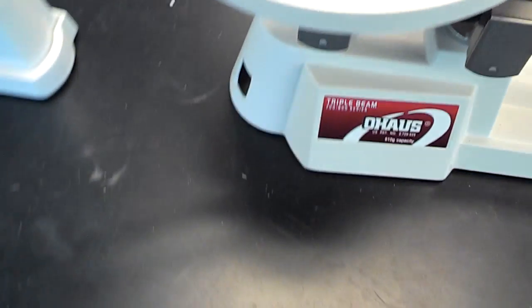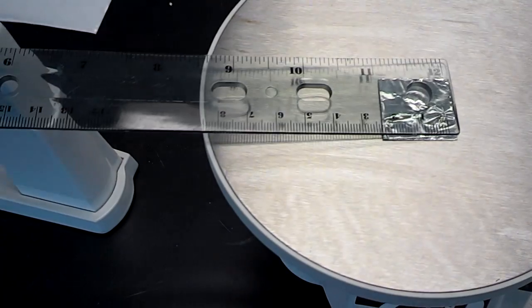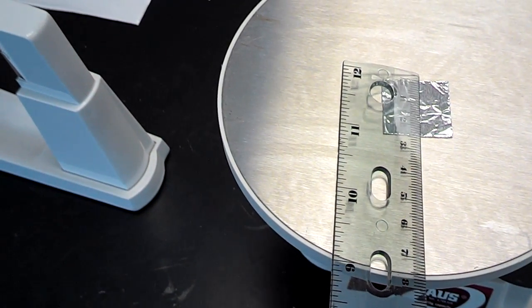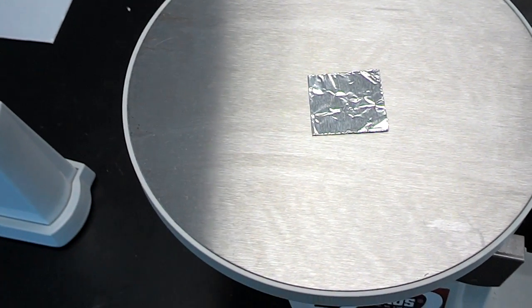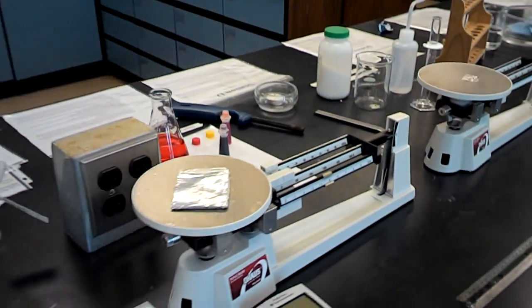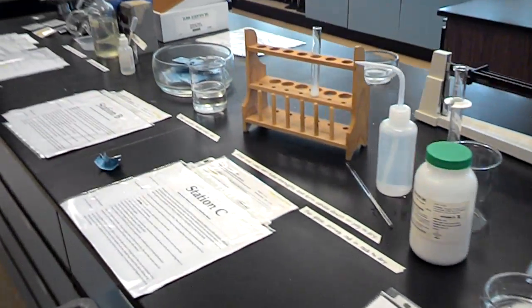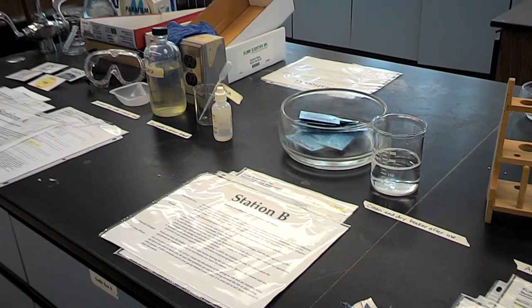Here, these are in cubic centimeters, you would use about 2.5 by 2.5, and then the height is a little less than 0.1, so maybe 0.05. So if you put those in your calculator, you'll get the total volume of this one. And congratulations, you have completed the Physical and Chemical Changes Lab for Clear Horizons Early College High School. Record all your observations, and also don't forget to answer your post-lab questions.